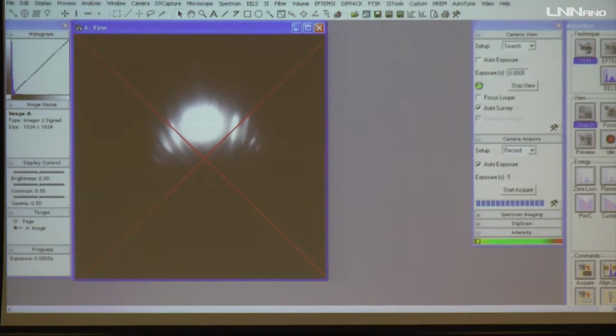That looks better. Now I'm using a Y direction. So now I need to look for, I think its value is coming around 1500. So I believe it should be okay. And it's not in the optic axis. We believe this is our optic axis. It's a little bit away from the optic axis. So I need to bring this one over here.